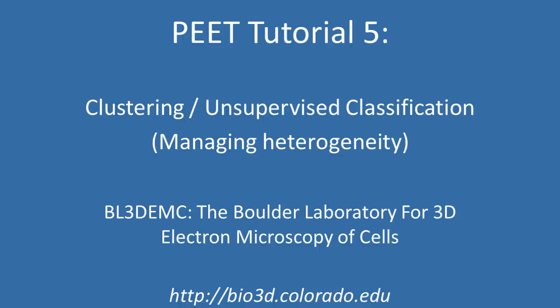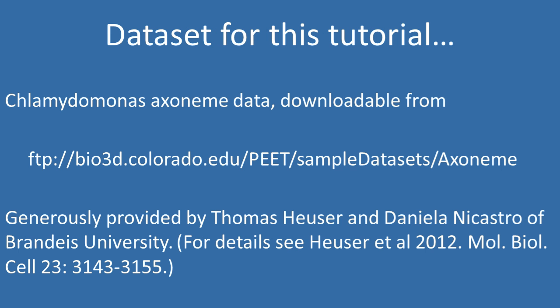Welcome to the PEET tutorial on Clustering or Unsupervised Classification. Subvolume alignment and averaging implicitly assume identical particles. In this tutorial, we'll look at some of the tools PEET provides for detecting and dealing with possible heterogeneity in the data.